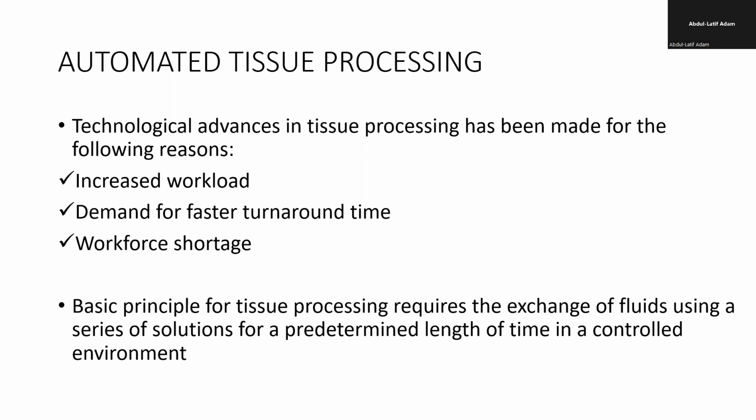Okay. So the tissue processor works in 2 ways: either the tissue moving, or the tissue staying and allowing fluid in. Okay, so we have the fluid exchange method, where the tissue is at standstill, and the fluid goes in and out, okay?